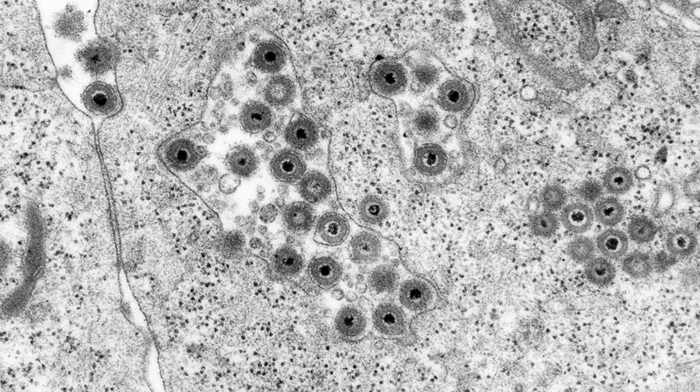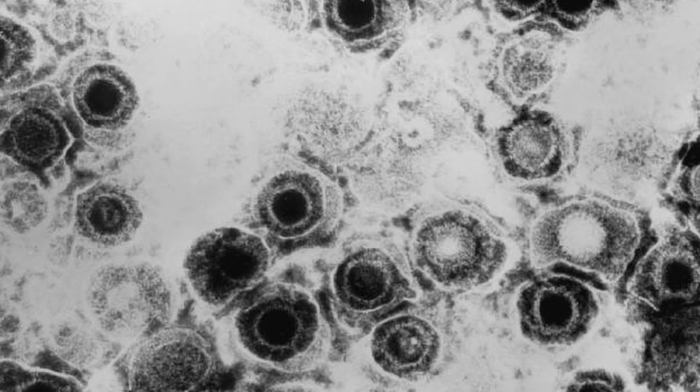So my name is Blažej Segelski. I have been a worker, and right now I'm a master's student in the group for virus biophysics at BMC. I have been working with the group for the past 3.5 years already, and I have been involved mainly in working with microscopy, detecting the viral infection, and working with a system that is supposed to detect the infection of the viruses from a single genome all the way to something called replication compartments.